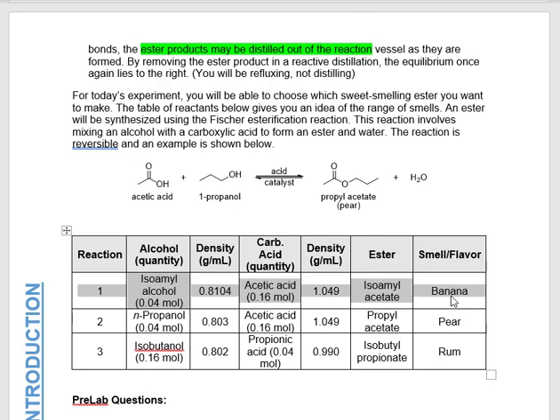And so you can actually use the smell. You don't want to directly sniff the compound, but you want to waft it. You kind of hold up the container and use your hand to wave the smell towards your face, okay? That's always a good practice. Never directly smell anything. Sometimes you could faint. You could get knocked out by certain aromas or fumes that come off of reactions. So never directly smell anything, just like you would never directly taste anything.